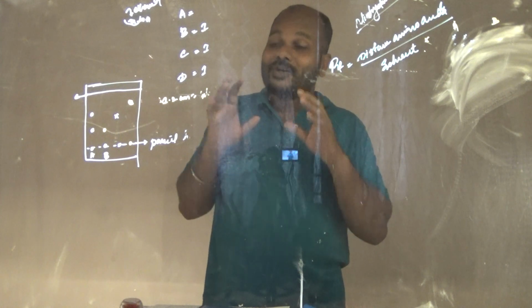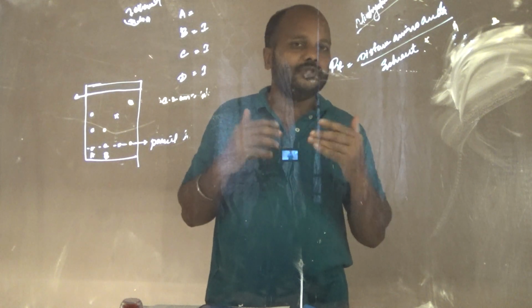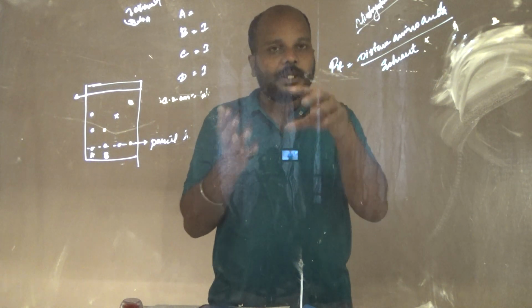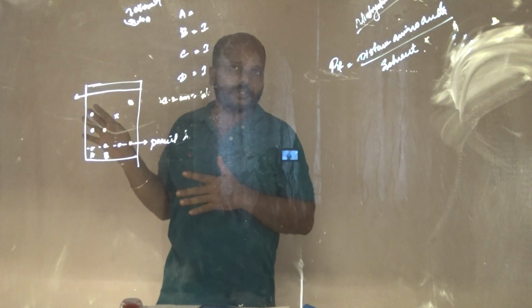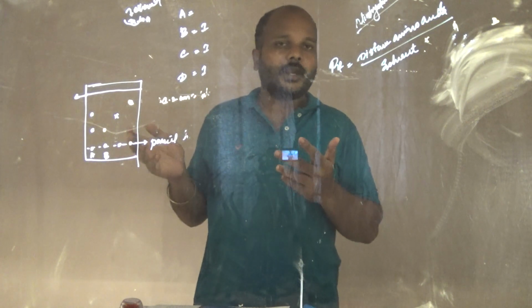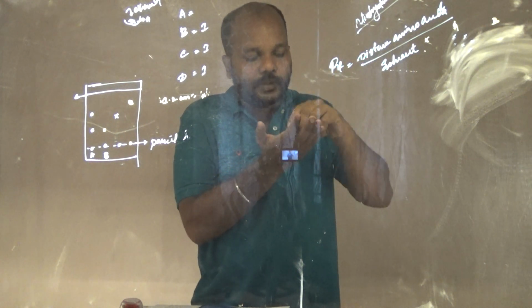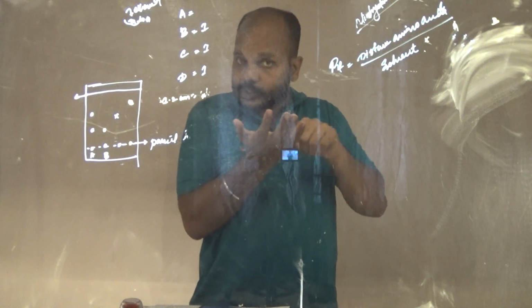If we look closely into paper chromatography, there are many uses, even in forensic sciences and food detection. For example, you take a food, say milk or cereal or some animal food like meat, chicken or beef. You take a small piece of beef, grind it, add some ethanol or some solvent and mix it properly.